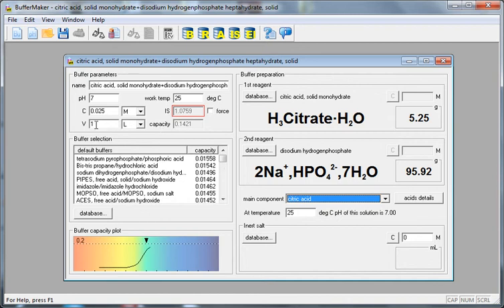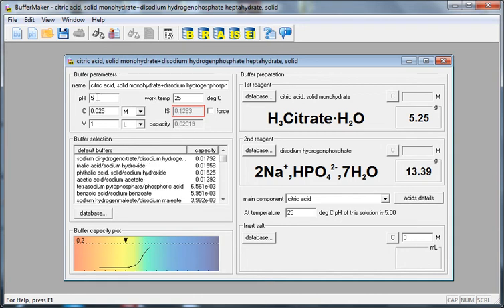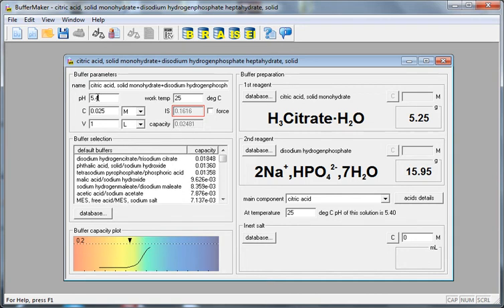Now, just entering volume, 1 liter, concentration 0.025 moles per liter, and pH, let's say 5.4, will yield a recipe here.